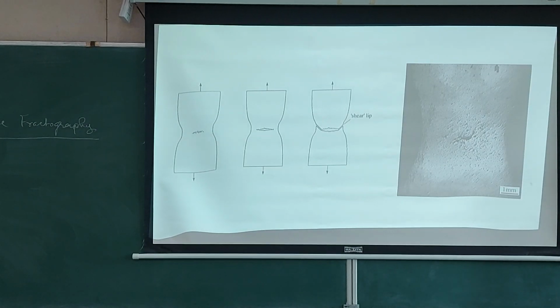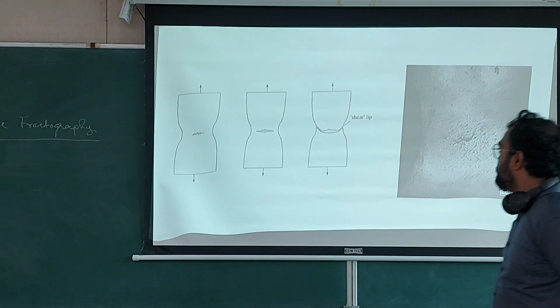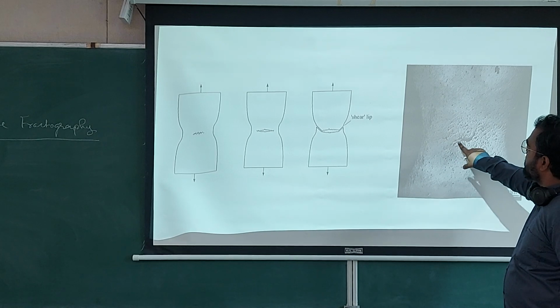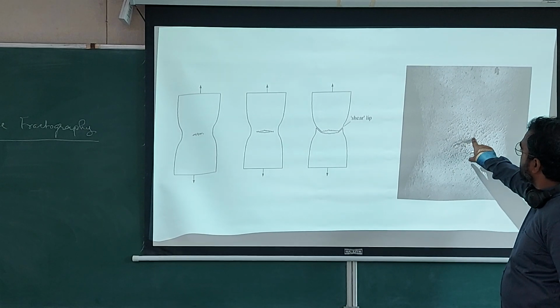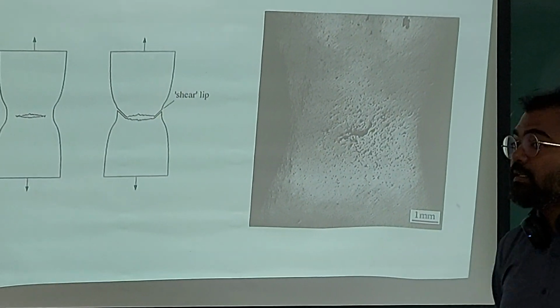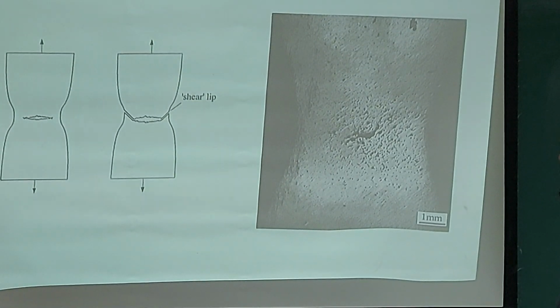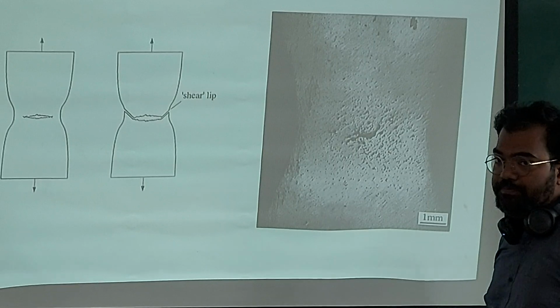And in this picture you see how the voids are developing. You can see there are voids everywhere. Very close to the neck area you have a lot of them, and you have coalesced voids here, and this whole coalescence appears to follow the shear direction. But you have coalescence at other locations as well, but they have not increased to the critical size. Whichever obtains a critical value beyond which it cannot grow further will just start cracking in that direction.